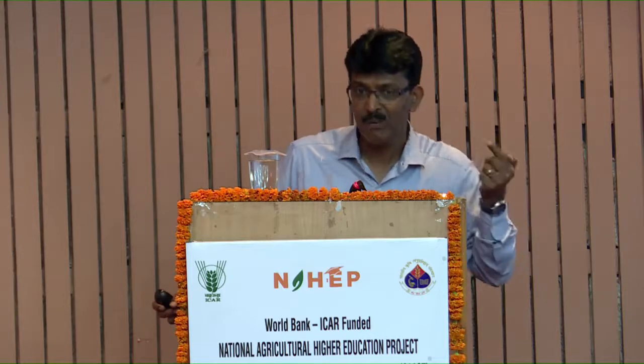So using this particular criterion, you can make a standard curve, right? Because the CQ value or CT value is a value in terms of number. It looks small.